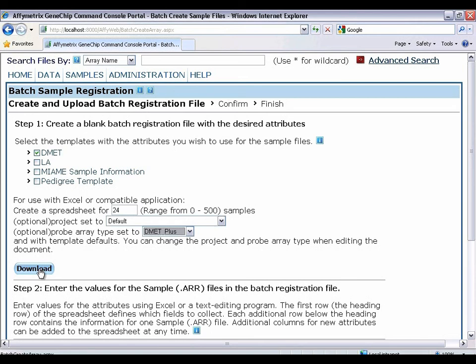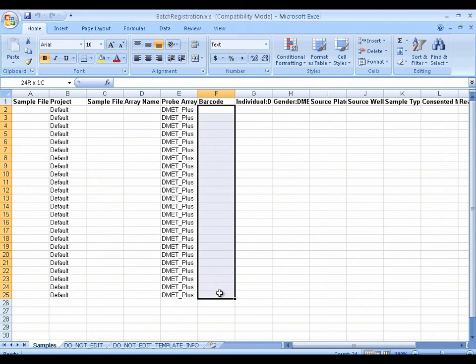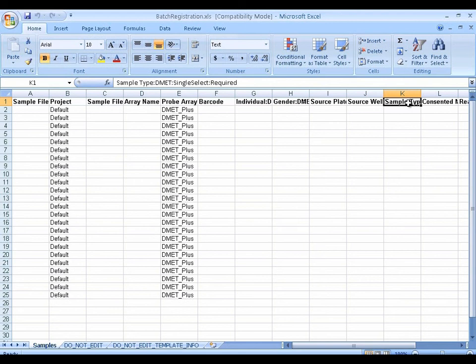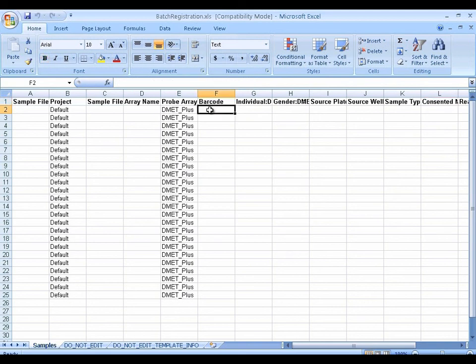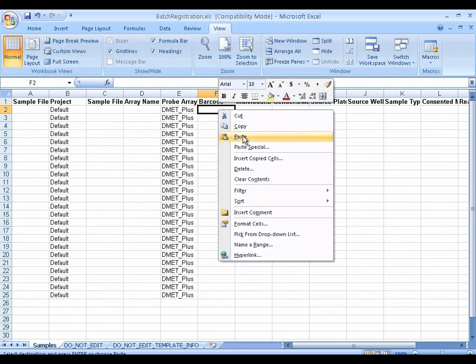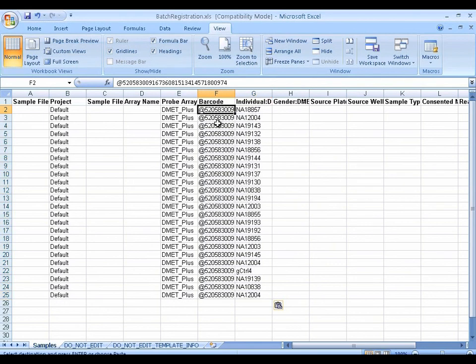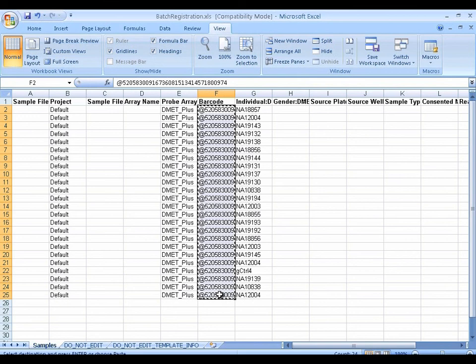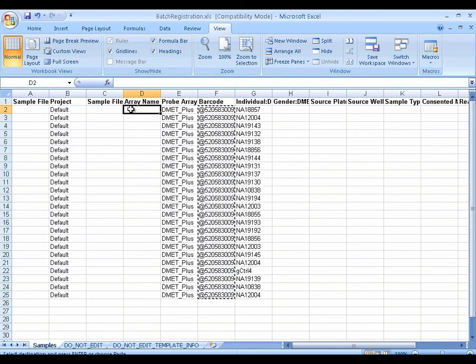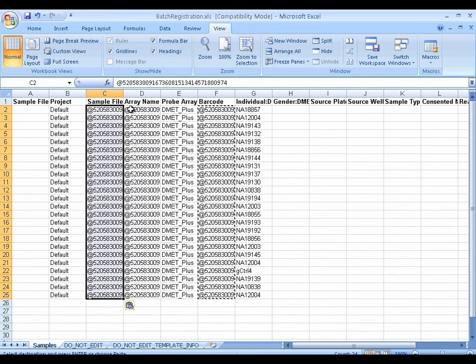Then I can enter the rest of my values. So we need to fill in the barcodes that we're using. And for each barcode, we need to know what the required sample type is and the consented marker list. So I'm going to copy and paste that information from another worksheet. And I'll name the files with the same name as the barcodes. So we have both the sample file name and the array name.